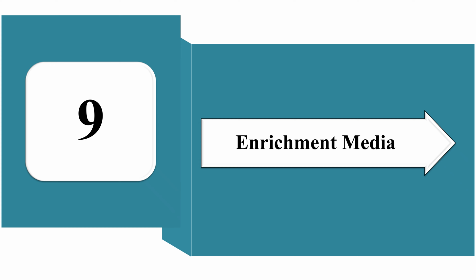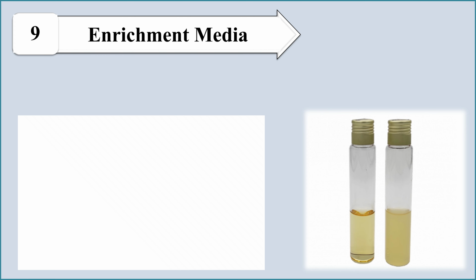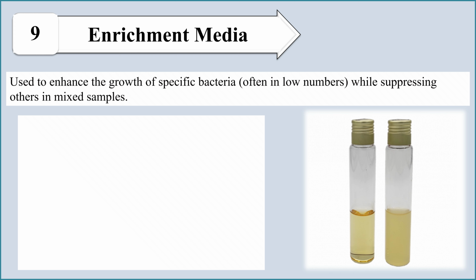What is enrichment media? These are the media that will allow the growth of specific bacteria that are often present in small numbers in the sample that arrived in the laboratory and will suppress the growth of other unwanted bacteria.